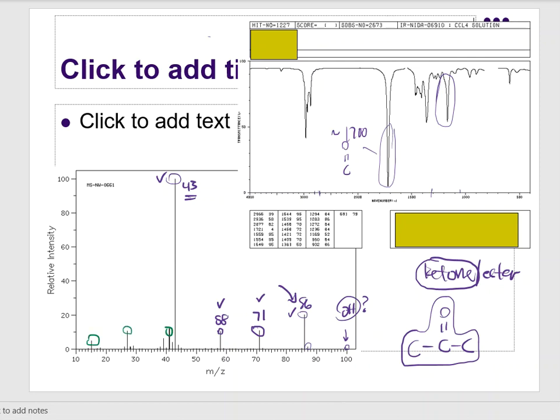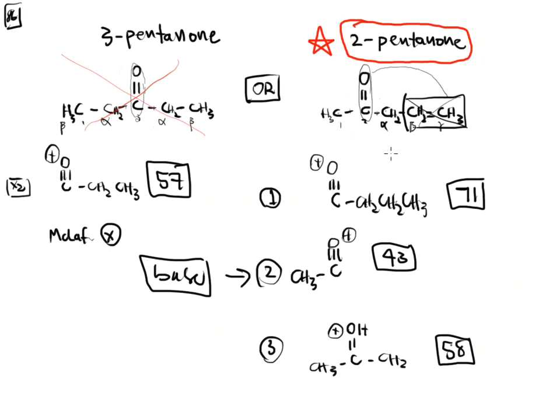Because we did not label those. Well, I keep mentioning over and over, these are just the most common fragments that I would see. I'm not saying that the molecule cannot break up in different ways. I'm not saying that this molecule can't just give off a CH3 group or a CH2CH3 group. It can, because think about it. We said that if the molecule cleaves this way, then that gets the positive charge. Well, what I'm left with is a CH3 after this point, right? Well, nothing says that the positive can't go to that CH3 sometimes. We've already discussed that possibility in that scenario.